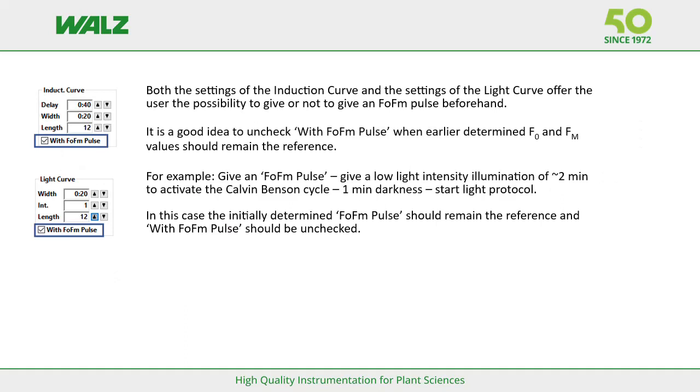So far, I did not touch on the with F0FM pulse box. If the with F0FM pulse box is checked, light curves and induction curves start with an F0 and FM determination. If the box is unchecked, the software skips this determination. Unchecking with F0FM pulse may be meaningful in the case of light curves.